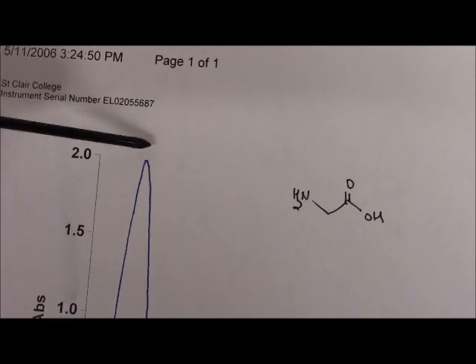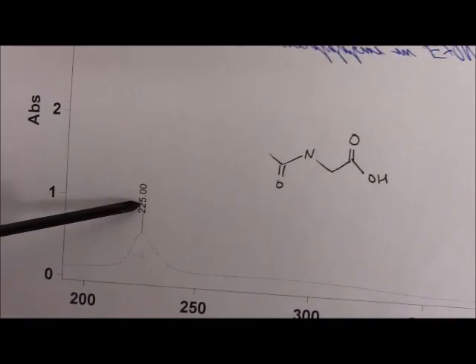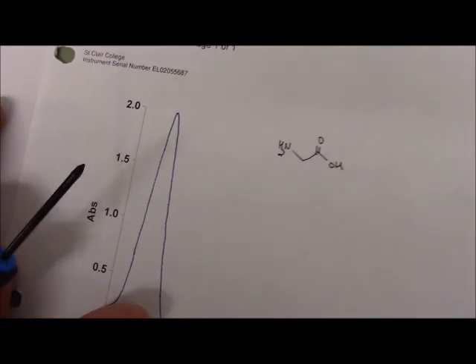Technically, you have to use the peak picking button on the software to get that number, just like we had here. So UVs, there's really not much to it. You just record them, you get a mark for it, and you only discuss it if something really strange shows up in it. Next is the IR.